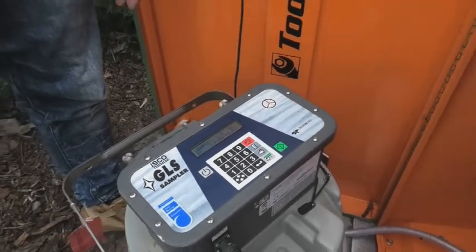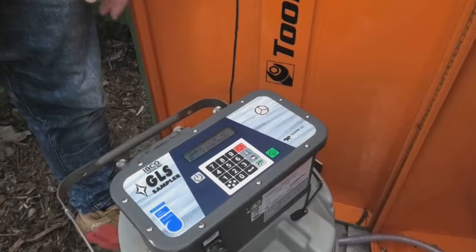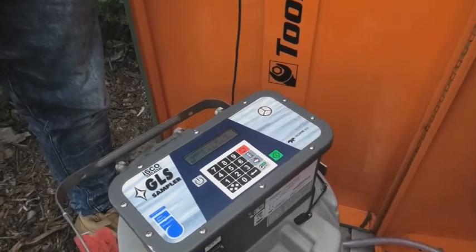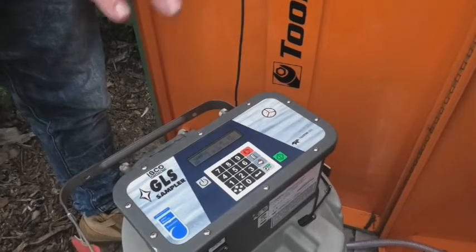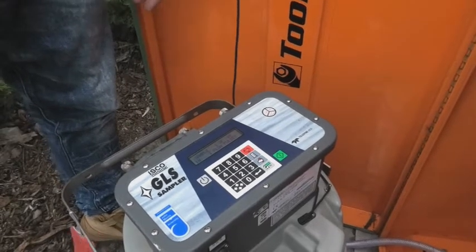So Darren, do we do that each time we collect samples from there? Yes. So for every event that you come out to collect and reset, you have to reset the samplers as well as reset the logger.